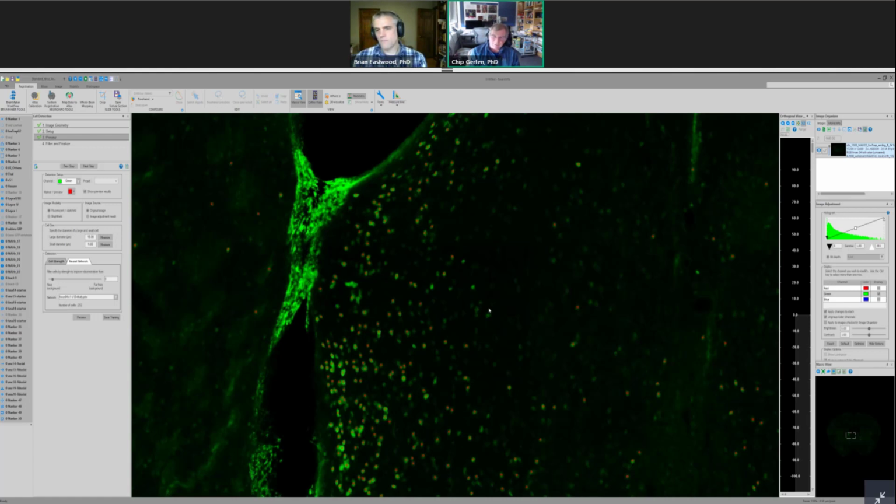In the cases of the pyramidal neurons, we feel fairly confident that the network is picking out actual objects because cells are either labeled or not labeled. With c-fos, it's a bit trickier. Okay, so version 13 did a good job. Anything else now? It just shows that it's continually evolving.